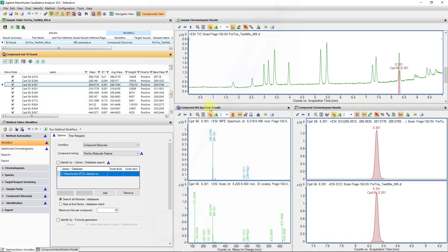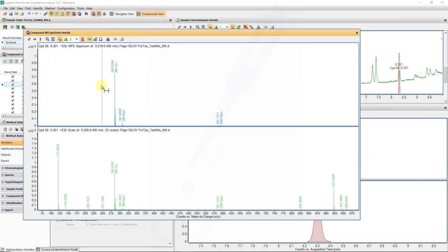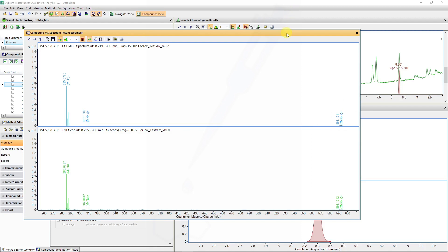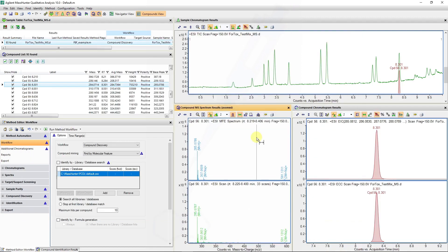With the diazepam molecule at 8.3 minutes, we can see that various different charge adducts have been grouped together by the algorithm because it's found them as coeluting features, and it's even found the dimeric-sodiated version. The next step is really trying to predict the formulas, as if this were a true unknown sample.